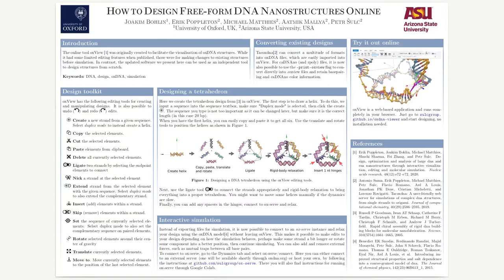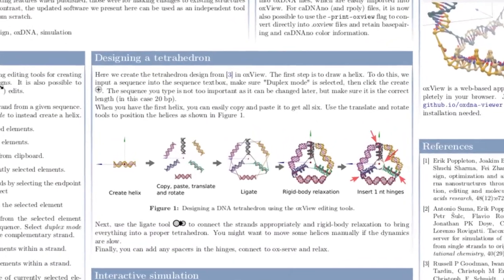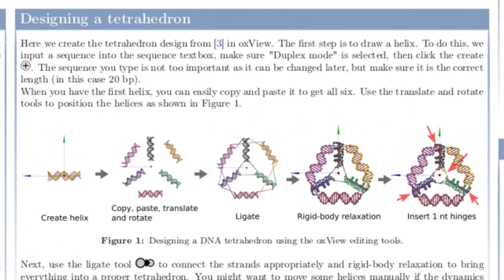Welcome to our poster on how to use Oxview to create freeform DNA nanostructures online. I'm going to show you how to create this tetrahedron in this video, but also join us at the poster session to see how all the different features can be used.